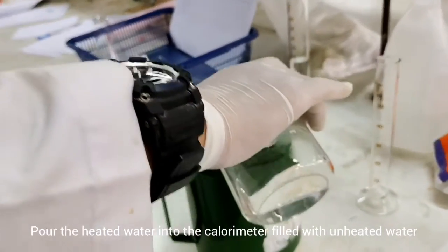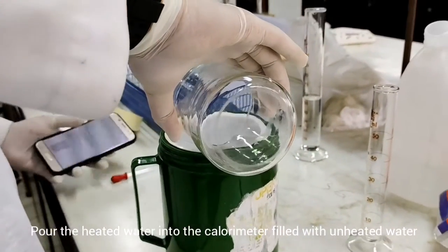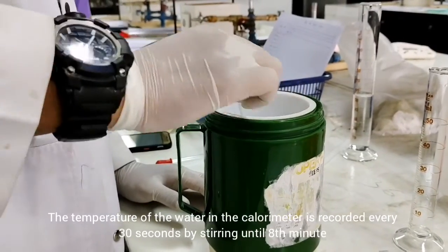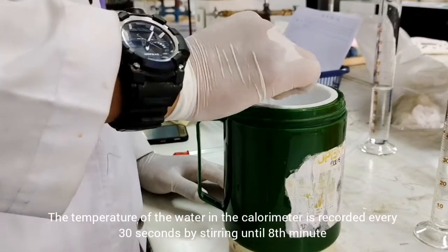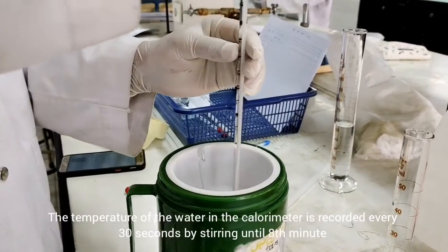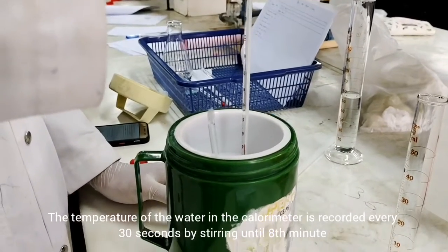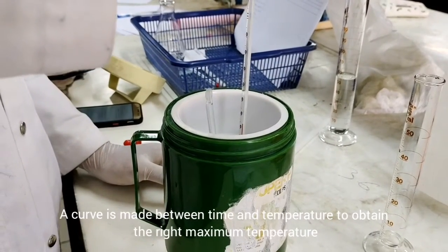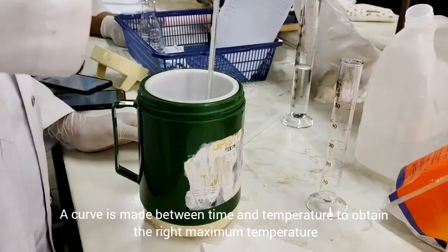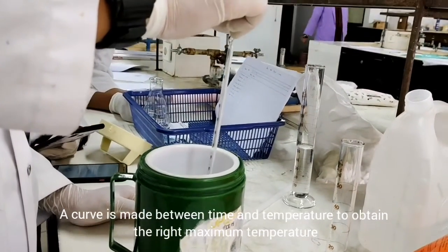Then, pour the heated water into the calorimeter filled with unheated water. Next step, the temperature of the water in the calorimeter is recorded every 30 seconds while stirring until the 8 minutes. And the last, a curve is made between time and temperature to obtain the right maximum temperature.